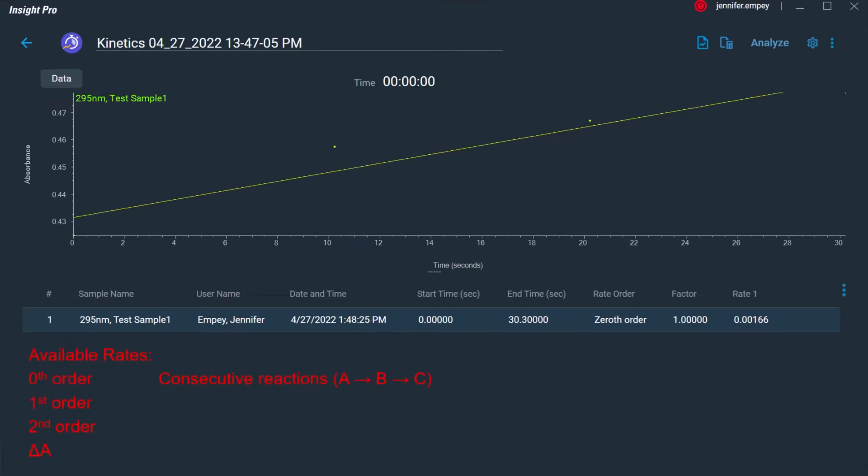After data collection, the absorbance can be fit to a selection of common rate equations, including first order, second order, and consecutive reactions, among others. From these fits, the reaction rate and activities can be determined.